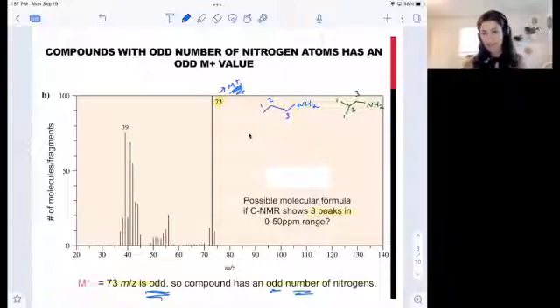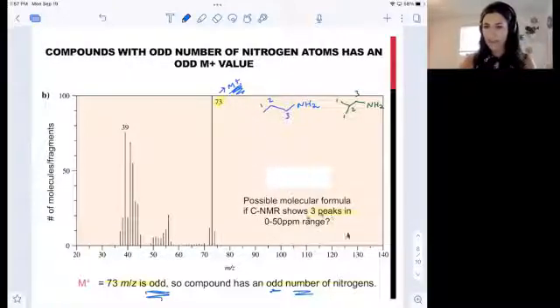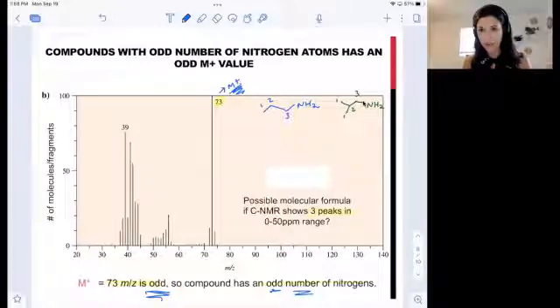We could consider a hypothetical scenario like the one we did at the beginning of the video, where I have an unknown and I know it has an amine. I know it has 3 types of unique carbon. I might be considering a list of possibilities and encounter the blue molecule and the green molecule. They both contain 3 types of carbon and a primary amine.